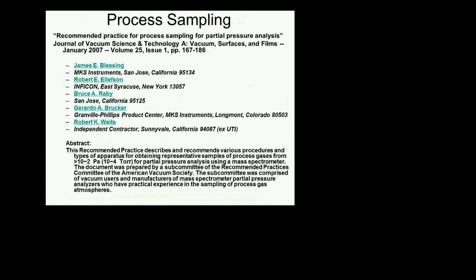Everything we've talked about so far was the case in which we take the RGA and connect it directly to the vacuum system. The RGA is immersed directly there. And that's all great as long as the pressure of gas never exceeds 10 to the minus 4 torr, which is the maximum pressure that is allowed. Unless you have a miniature, you can go to 10 to the minus 2, sure. But what happens if you want to analyze the gas in a chamber that is going to go higher than that? You're going to do a PVD process at 10 to the minus 2 torr, or a CVD process at a torr, or an ALD process at even higher pressures.